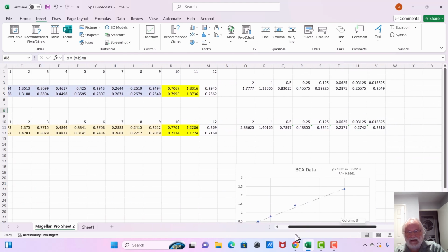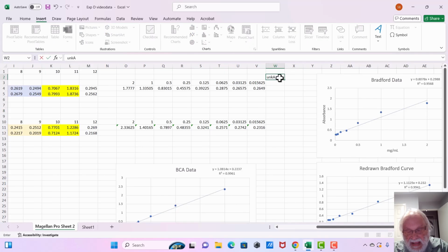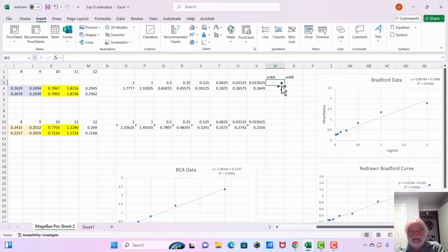Let's go ahead and put that calculation in. And let's go ahead and put unknown A and unknown B. We'll go ahead and take averages of them.